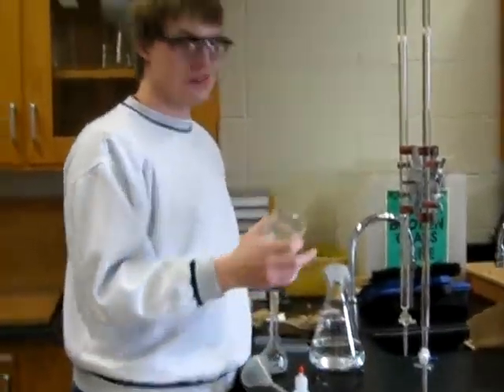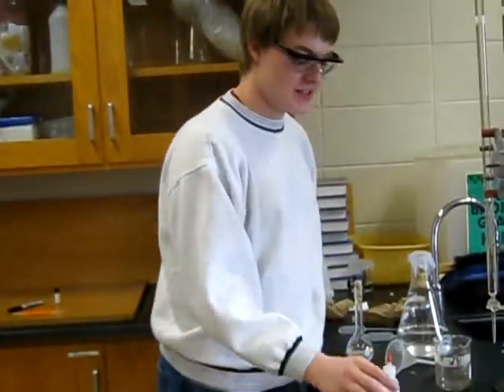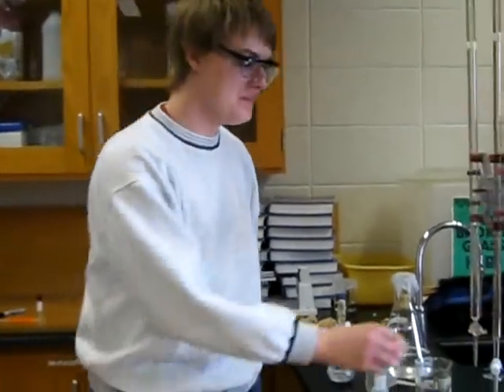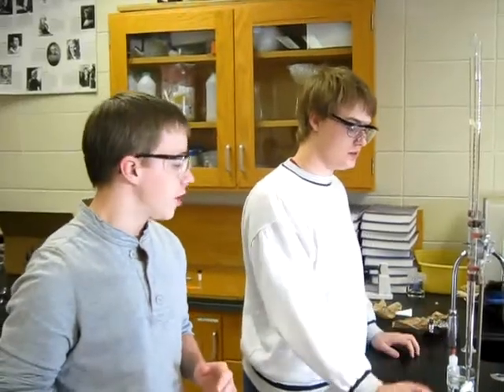The acid you will drain into a 200 milliliter beaker, down to the 10 mark, so you have exactly 10 milliliters in Trial one. Into the acid you will put 3 drops of phenolphthalein, so you'll know when it actually neutralizes. And for the base, you will just slowly drip it in, and drip it in until it hits the correct pink. So now we're going to actually go ahead and do the procedure.